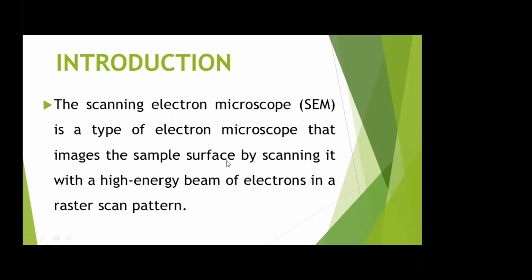How is the image generated? By scanning the sample surface with a high energy beam of electrons. What is the scanning pattern? The scanning pattern is a raster scan pattern. What is this raster scan pattern?